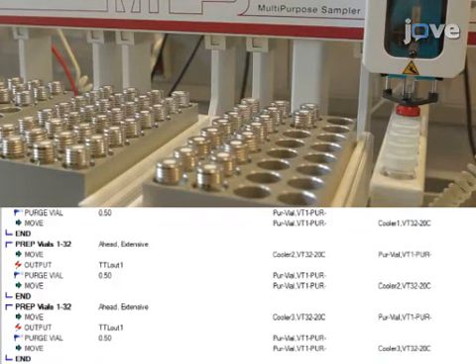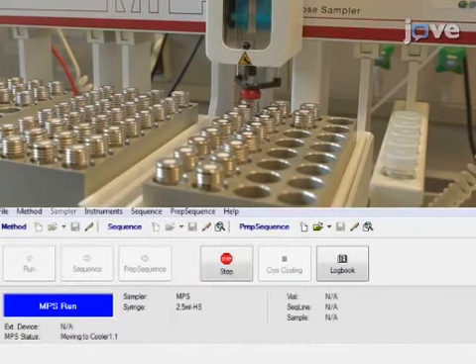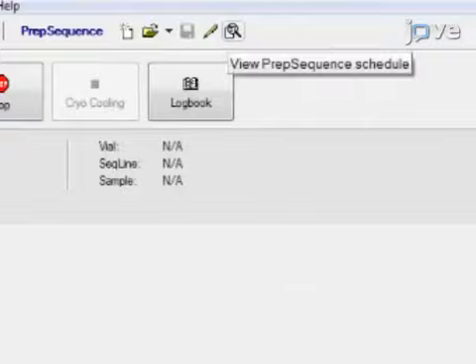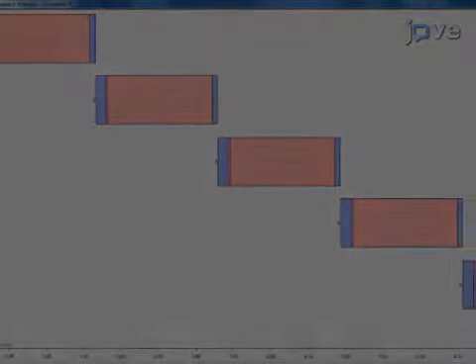Set the incubation time according to the typology of the desired process and the specifications reported by the starter culture manufacturer. Then, set the autosampler to analyze one sample after the other, obtaining an online volatile organic compound monitoring.